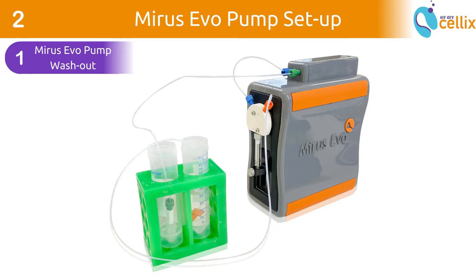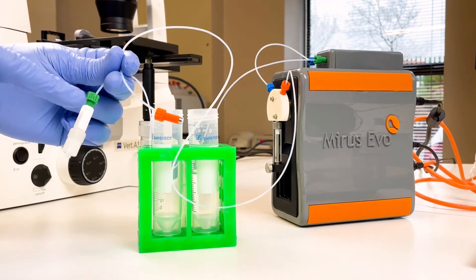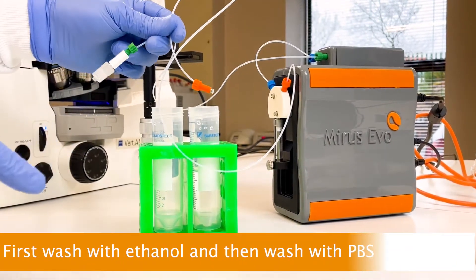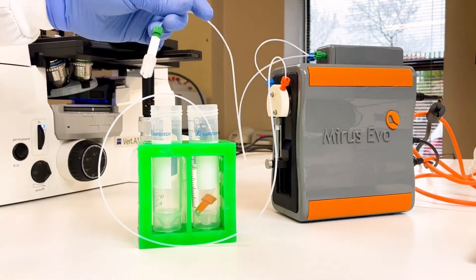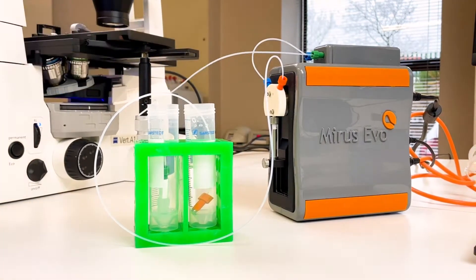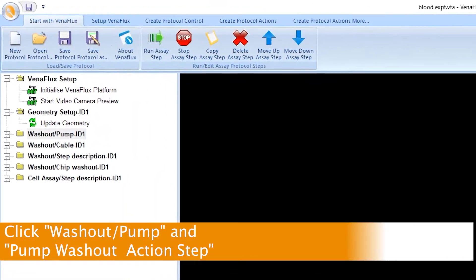First, let's wash out the MyReceivo pump. The orange connection is the input to the pump and the green connection is the output from the pump. The pump is washed out twice — first with ethanol and secondly with PBS. Place the orange connection in the ethanol solution and place the green connection into an empty tube for waste collection. Click Wash out Pump and click Pump Wash out Action Step.